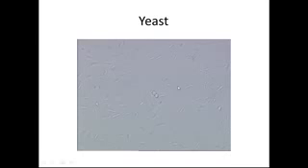So here's a picture of yeast, and they look like red blood cells. They're a little bit smaller, however they are not concave. And this yeast has a little bud here. We call this budding. And sometimes you will see bacteria also present.